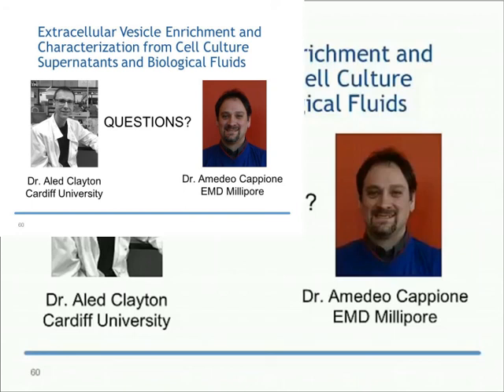All right. Wow, we've got some really great questions coming up here. The next one is, can I isolate exosomes from frozen tissue samples?